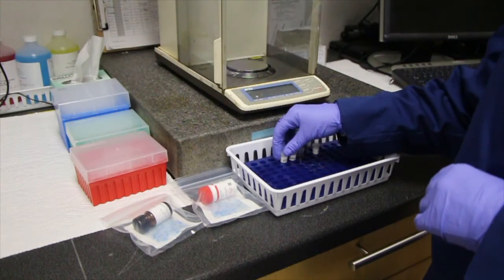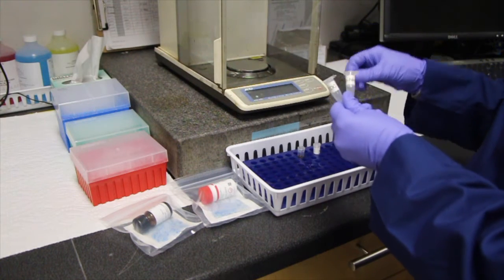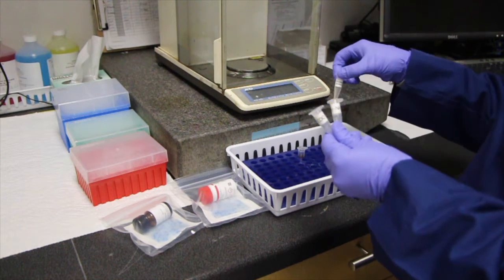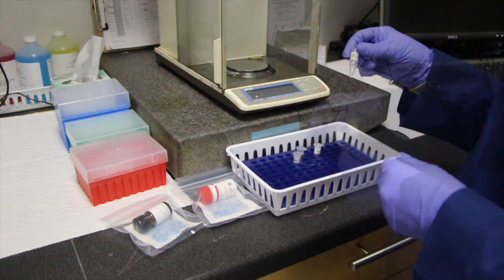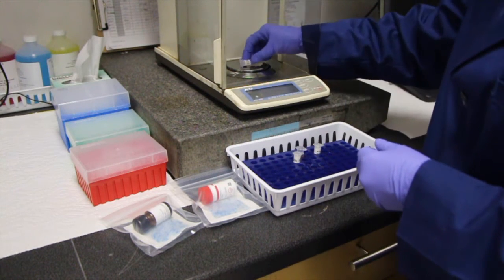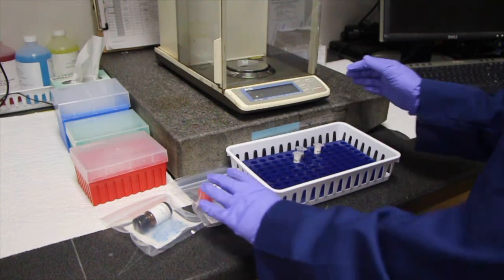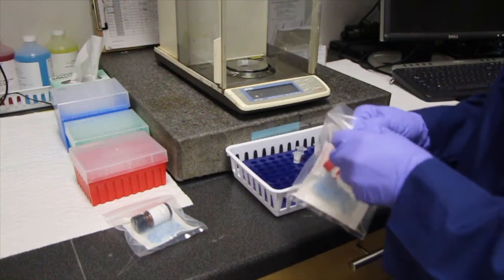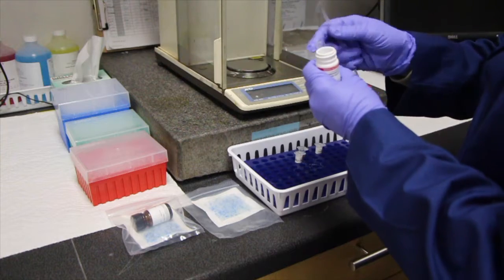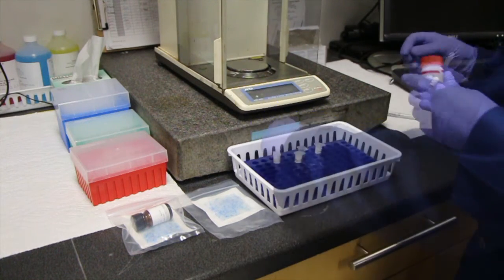Before you start, you'll need an Eppendorf tube labeled EDC, another labeled sulfo-NHS, an aliquot of BioReady gold, and your purified antibody. Place the tube labeled EDC on the balance and tare. Remove the EDC from the storage container. Aliquot between 2 and 10 milligrams into the Eppendorf tube and record the mass.